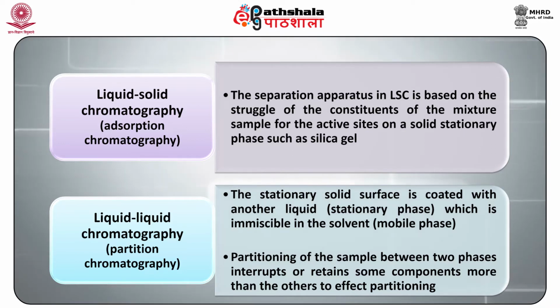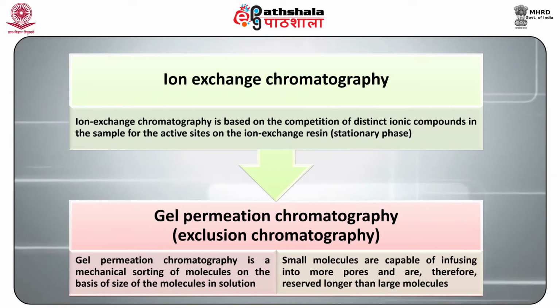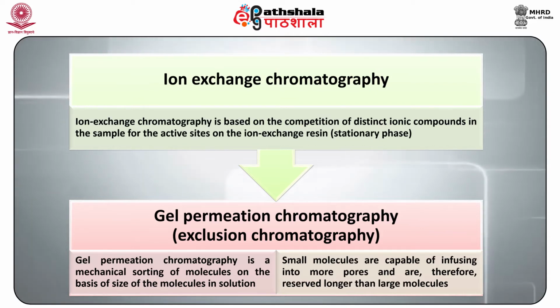Liquid-liquid chromatography, termed partition chromatography. The stationary solid surface is coated with another liquid stationary phase which is immiscible in the solvent mobile phase. Partitioning of the sample between the two phases retards or retains some components more than the others to effect the separation. Ion exchange chromatography. Ion exchange chromatography is based on the competition of distinct ionic compounds in the sample for the active sites on the ion exchange resin or the stationary phase.